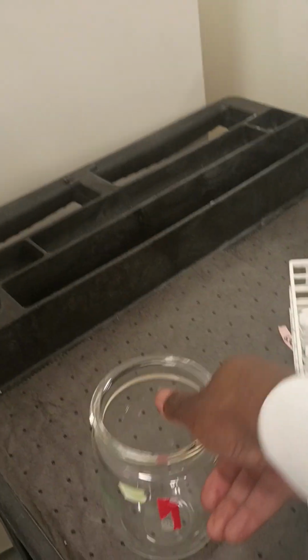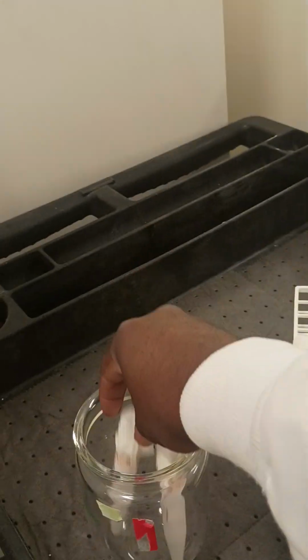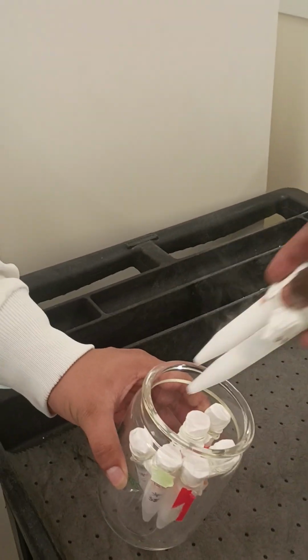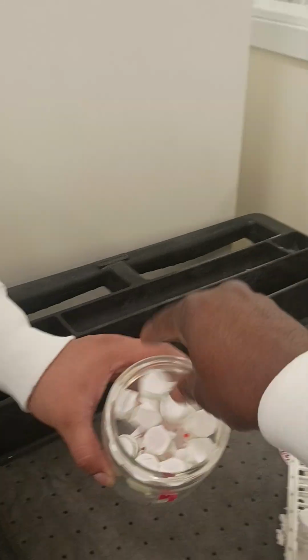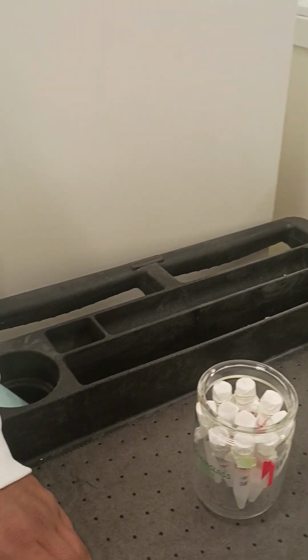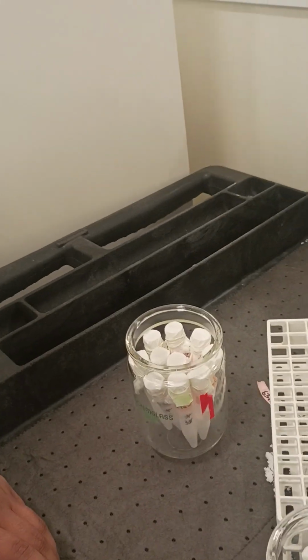So we get these glass containers, take 10 to 12 of them, with a lid on. Now we're going to lyophilize it.